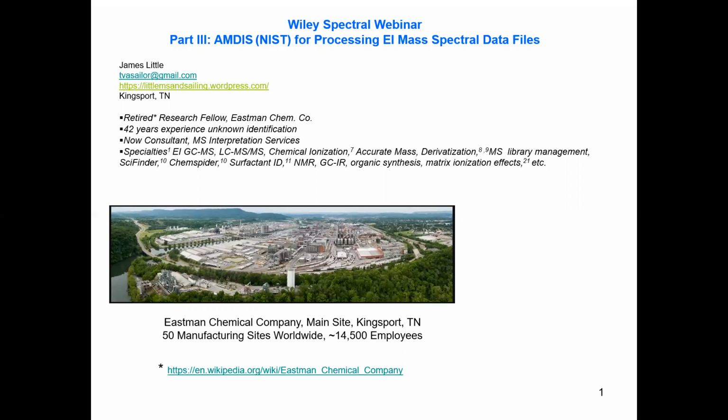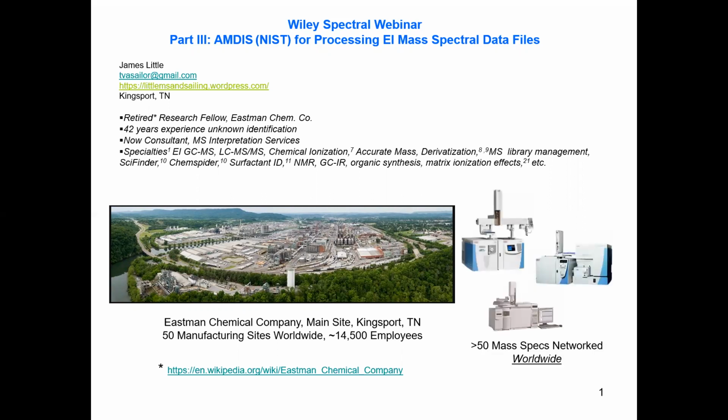Eastman Chemical Company has 50 manufacturing sites, about 14,000 employees worldwide. I worked in Kingsport, Tennessee at the main location. But what was most important, we had about 50 mass specs networked worldwide so that we could share data and information with each other, get expertise from local people and for remote people. So it was a very good situation for using the NIST database for solving problems, the NIST library and the Wiley library and the NIST Search software for solving problems.